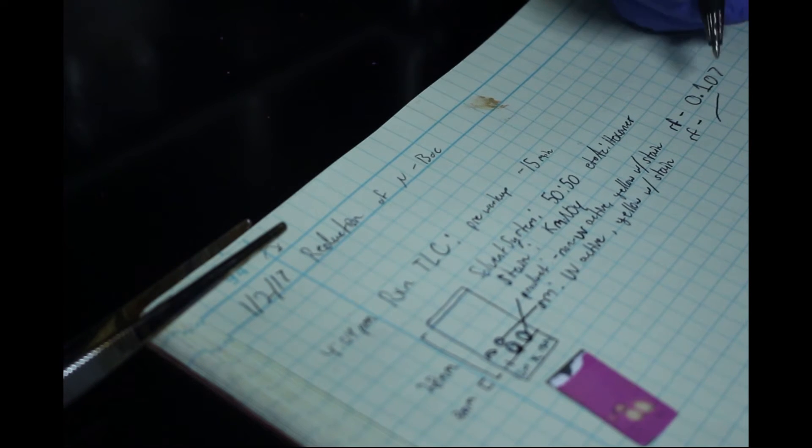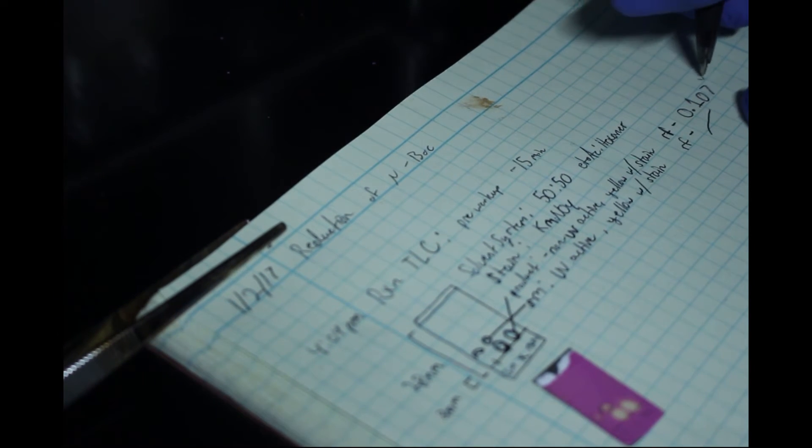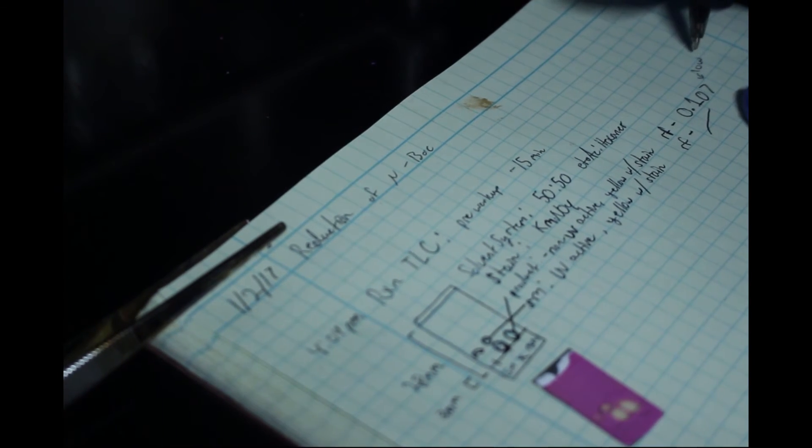After you perform TLC, adjust the polarity of your solvent system so that you can achieve ideal separation or an RF of 0.3.